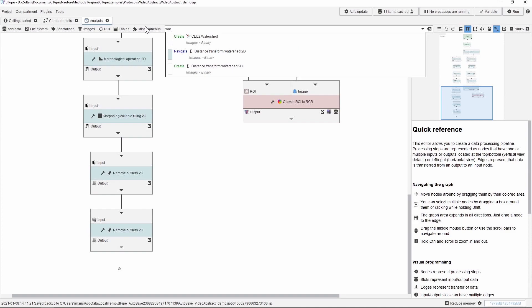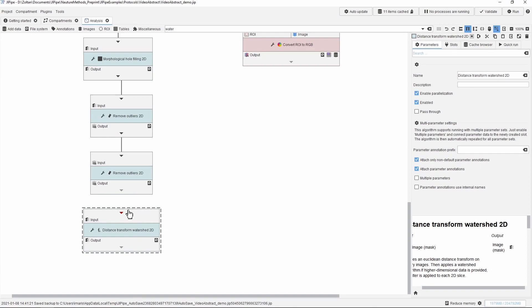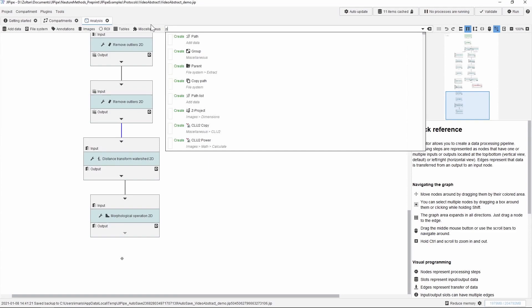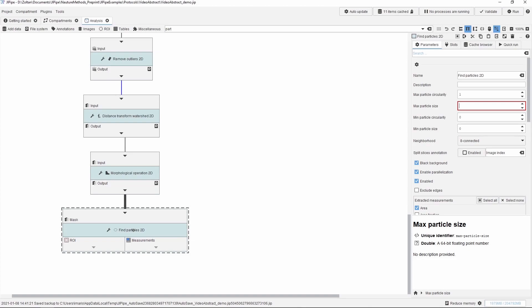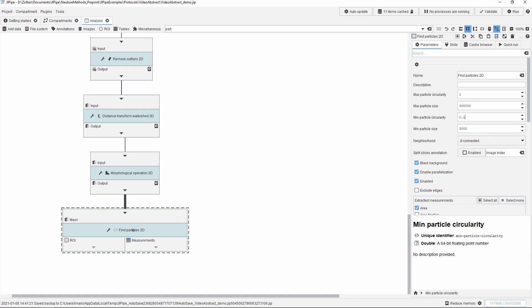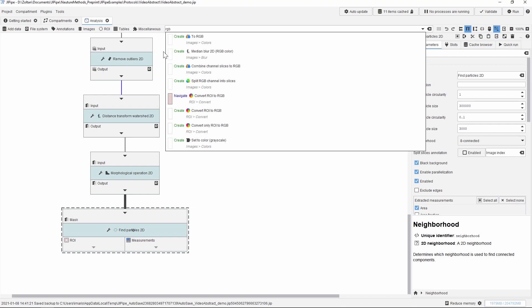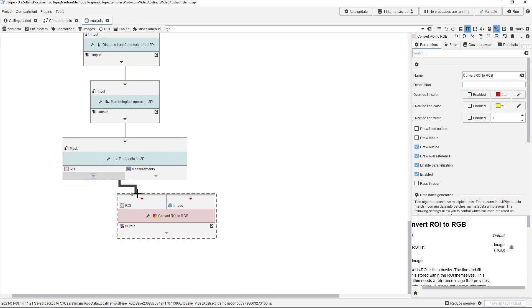Just like we did for the spores, we separate the macrophages with a watershed algorithm by adding the necessary node to the workflow. Then we add another morphological operation node for erosion, set up the parameters choosing erosion, select the radius, and we are done. The next step is finding the particles, so we apply the find particles 2D node, connect it to the morphological operator node, and set up the parameters including particle size minimum and maximum as well as the circularity minimum. Finally to finish this part of the processing we generate an overlay image by adding the node, connecting the region of interest and reference image. After running update cache we have the overlay.